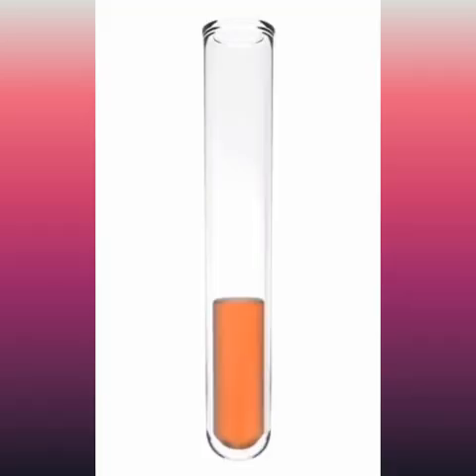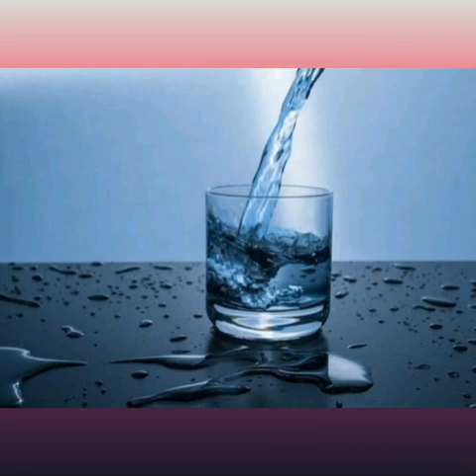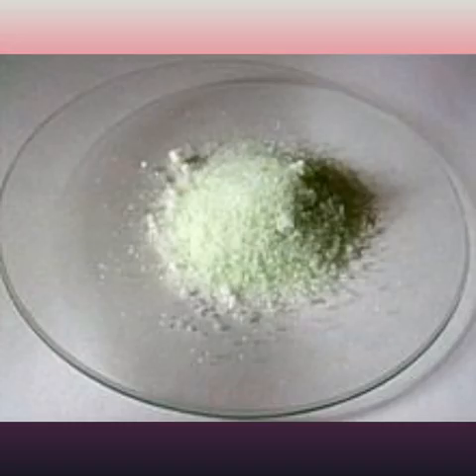You have three, can be 2, depending on the question that you're given. So make sure that your titer values aren't too far apart from each other. Also remember your formulas, CAVA over CBVB is equal to N, the number of moles. That's basically it for titration.